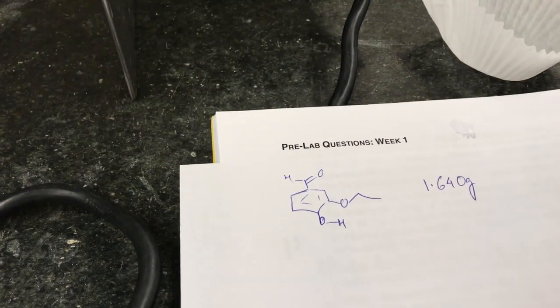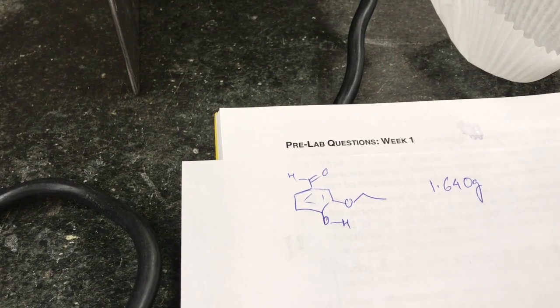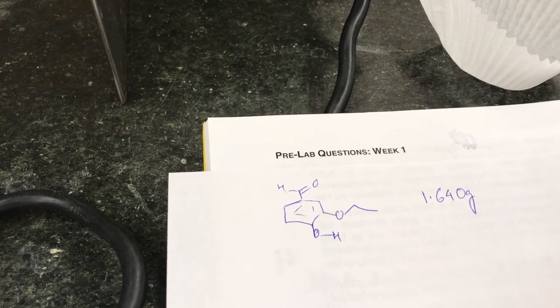Also, just for the record, I took about 1.640 grams of ethyl vanillin as my starting material. So please record it down. You'll need it for your final yield.